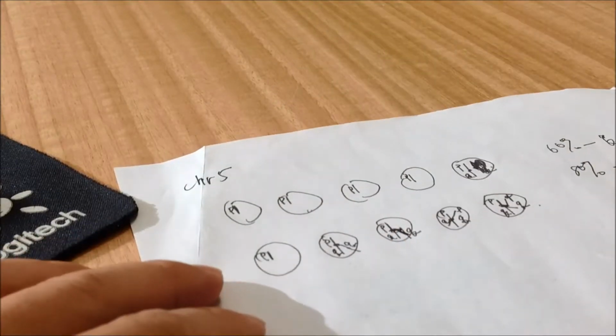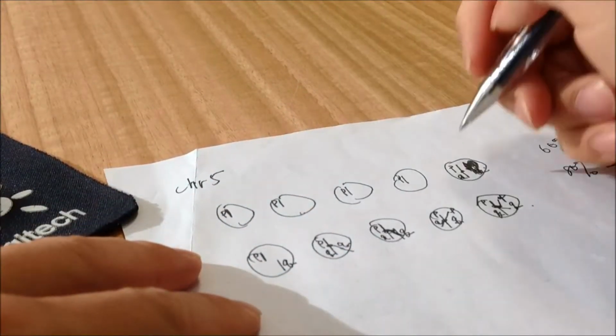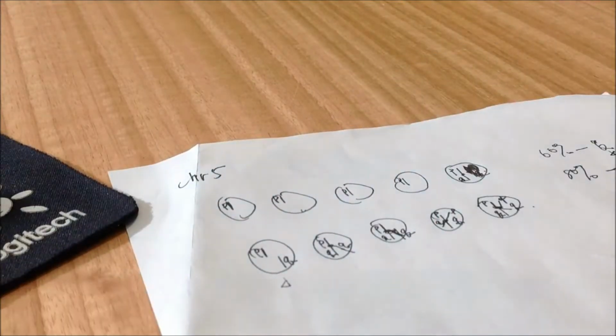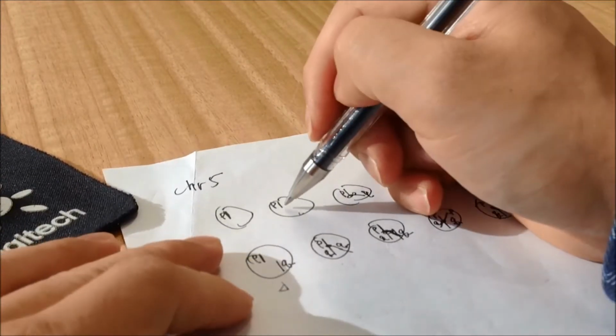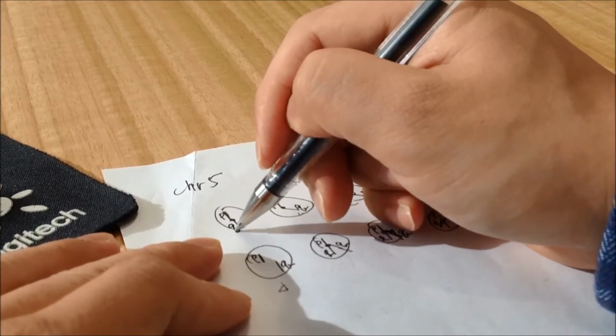While the others lost one copy of Q. So in this case, we may draw the lost copy of Q either like this or like this. We may not know until further evidence comes, such as FISH or paired-end sequencing.